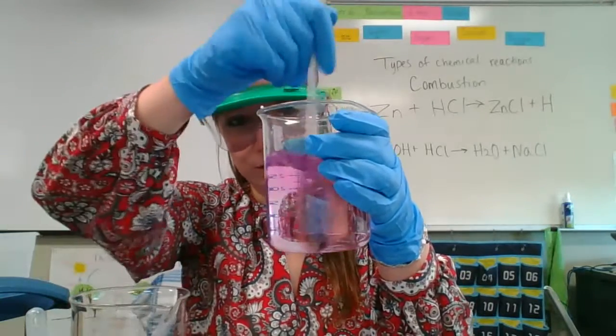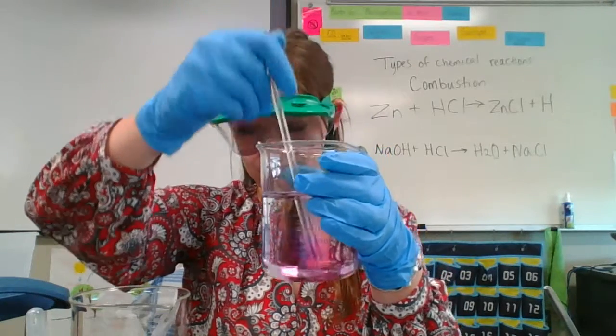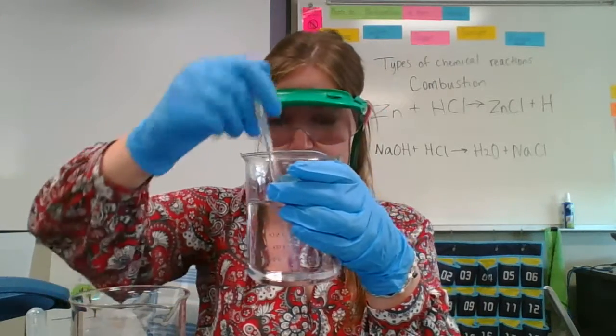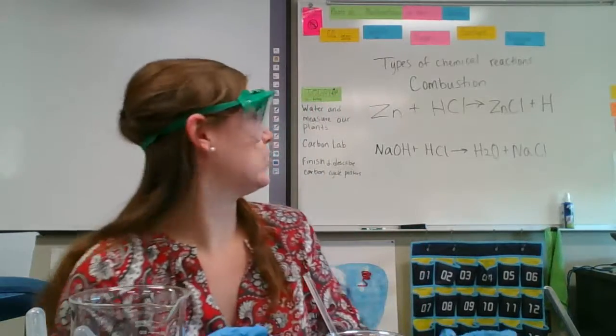Okay, getting a little bit better. Ah, there we go. Oh, it's coming back. Okay, so that completely reacted with the sodium hydroxide, the hydrochloric acid did, and it formed this equation behind me.